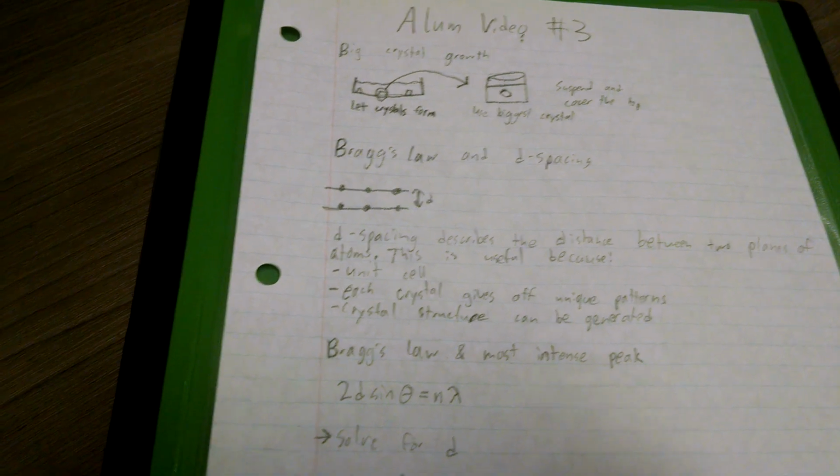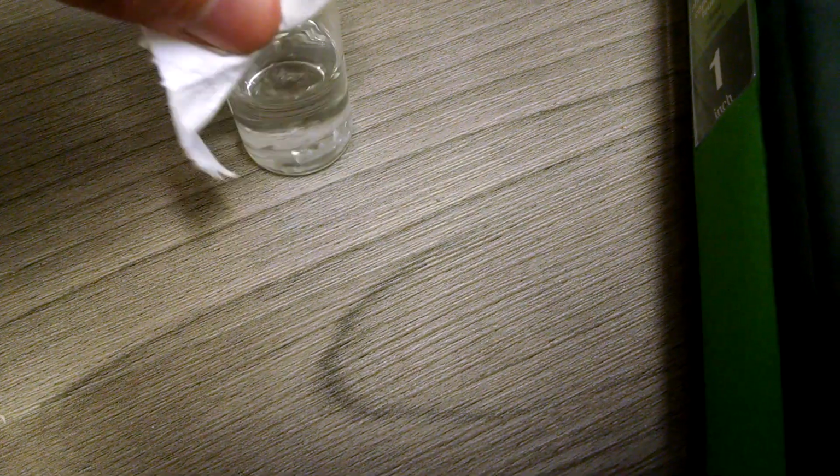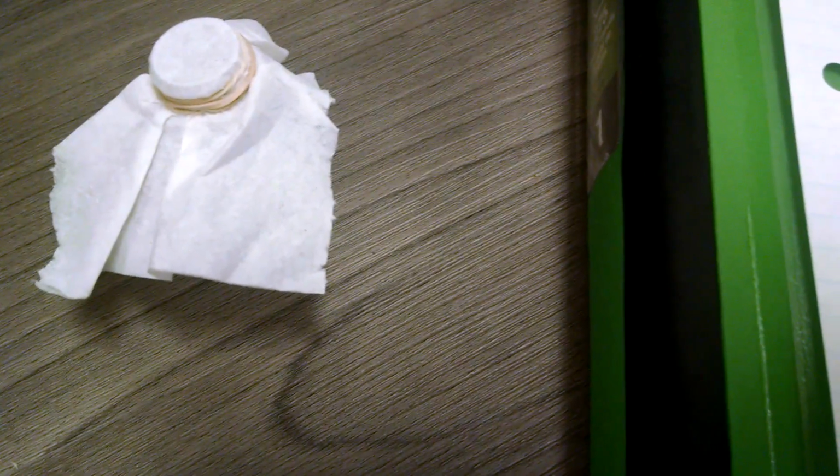To start off the video like normal, taking a look at the alum crystals. So, here are the alum crystals. Other than size, they haven't really grown that much larger since the last video. They're actually still relatively similar in size. I think this is very likely due to the fact that they've possibly already used up all of the alum in this solution. It's already all crystallized down, and while it's possible that hasn't happened, I think that might be a likely reason why they've all stopped growing.